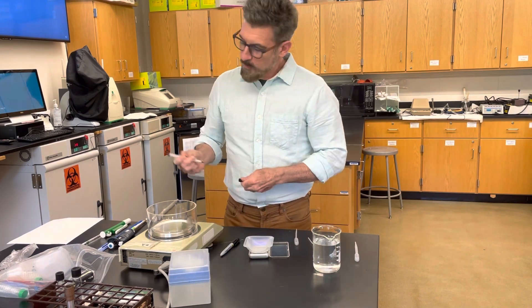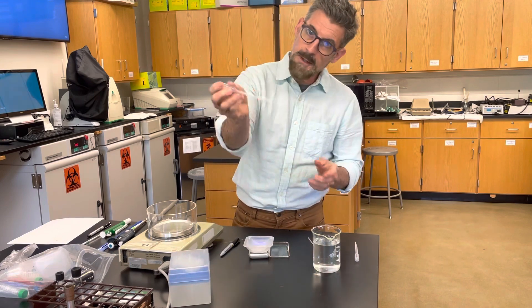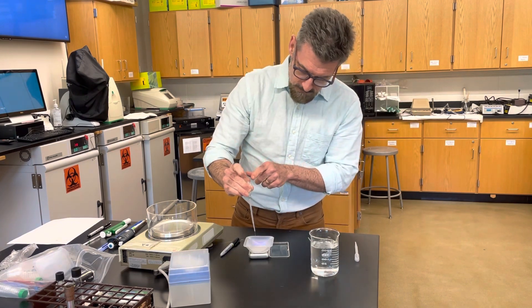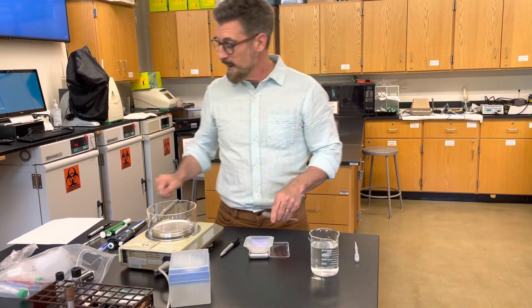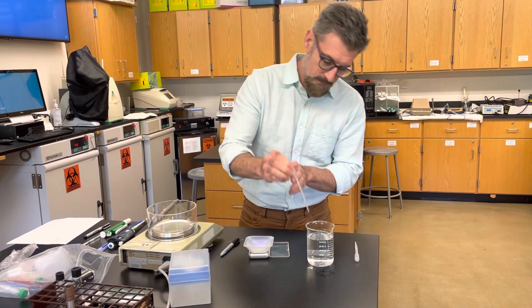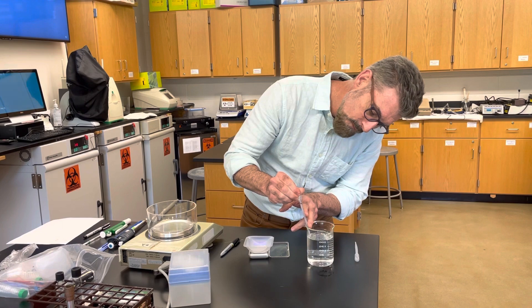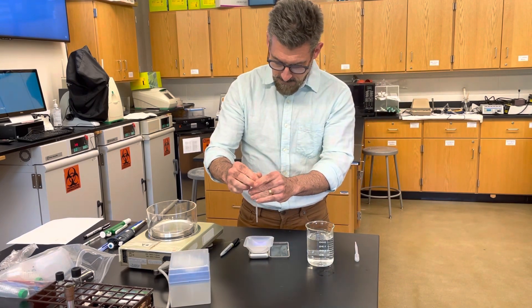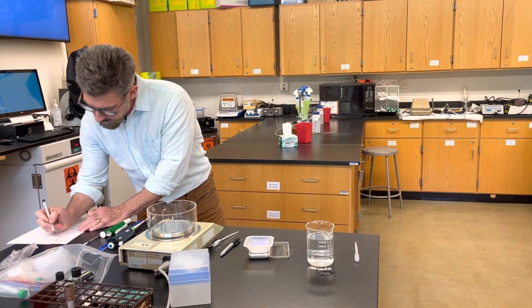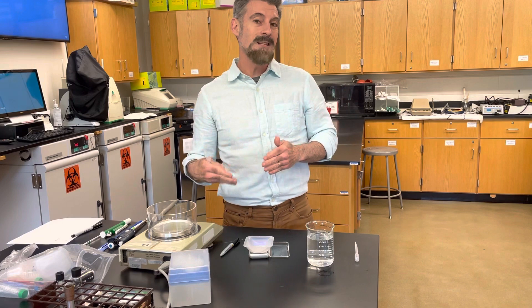I draw it up to the one mil mark and mine now says 0.98 — so that's what I'd write down. Then tare your balance, zero it out, and repeat. That time I'm a little less, at 0.96. I try to get a little bit above — there we go. It said 1.0 and now it says 0.99, which is very close. You just tare it and do it again and again until you get 10 data points.